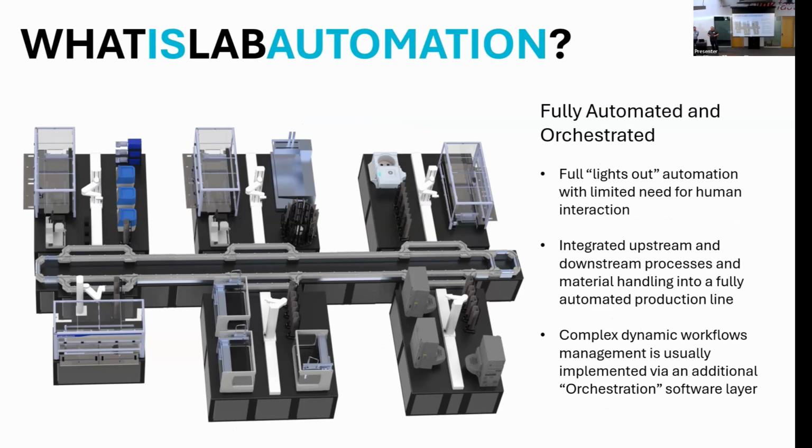And this differs in the lab quite a bit from the way it is applied in industry. And Imad will talk a little bit more about that later, in that it is usually built around more dynamic workflows, especially in the R&D space. There's a lot of evolution that happens in your assays over time, and you're not tooling up to run the same process for 5 years necessarily.